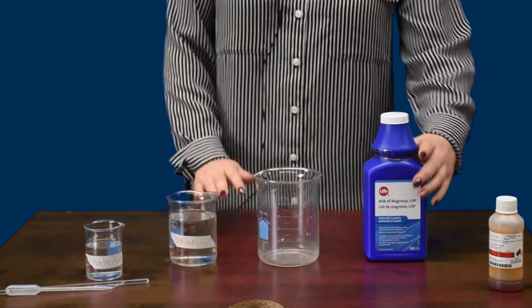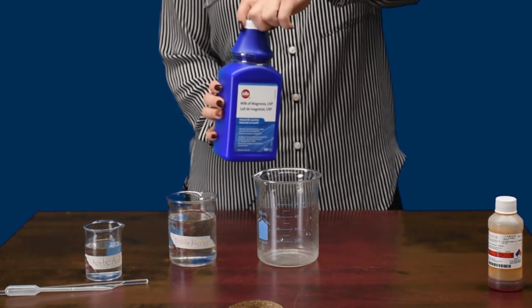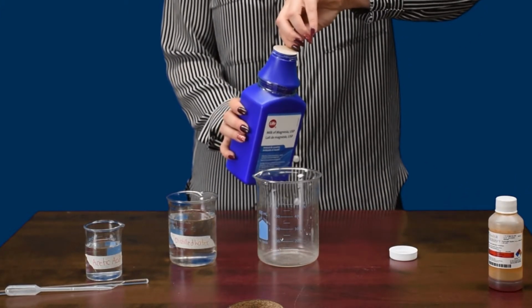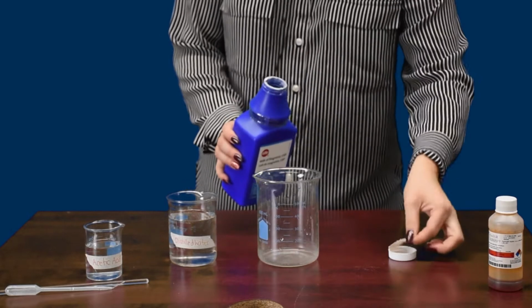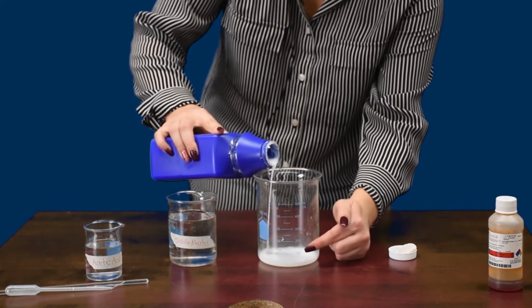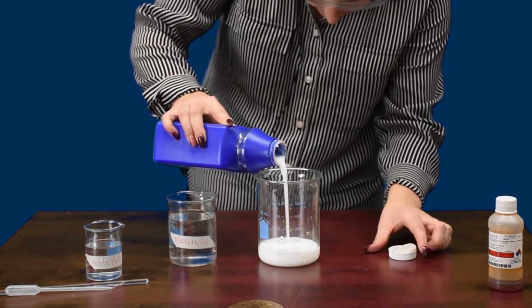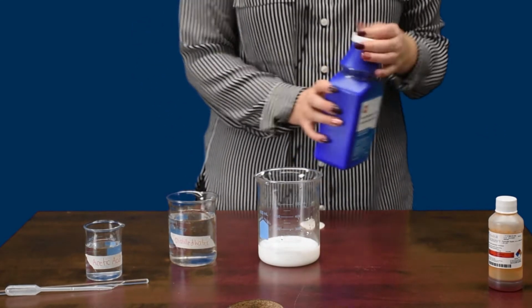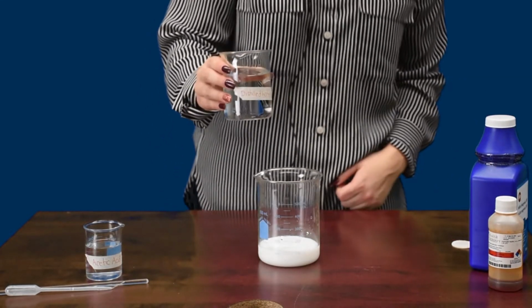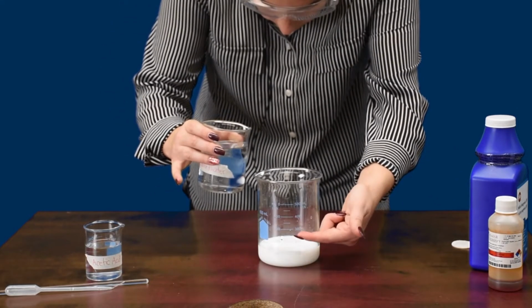Okay, let's get started. The first thing you're going to do is take your milk of magnesia. You're going to open it up, and you are going to pour it into your beaker up until 100 milliliters. After you have 100 milliliters of the milk of magnesia in your beaker, you can take your distilled water and you are going to pour it up until the 250 marker, which is right here.